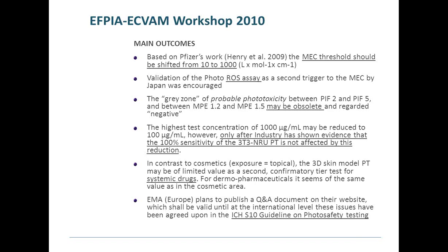The highest test concentration of 1,000 may also be too high, because what we know from another study that is not discussed today, a validation study that we performed in 1998 and was published in 2000 in ATLA, a UV filter study.